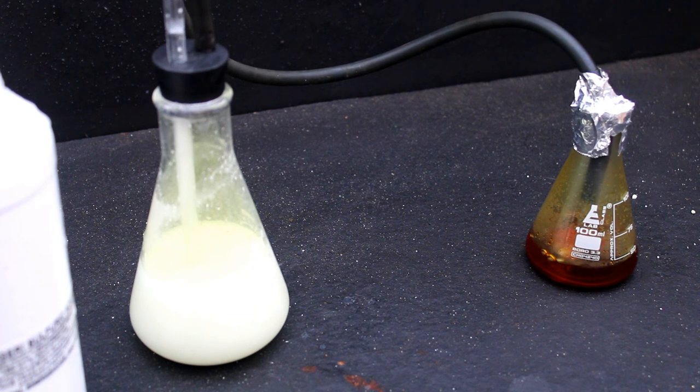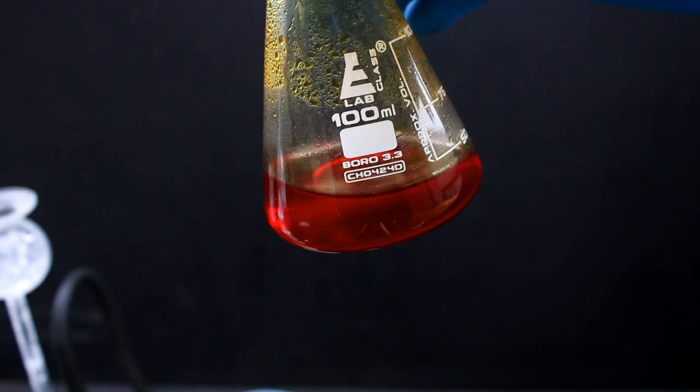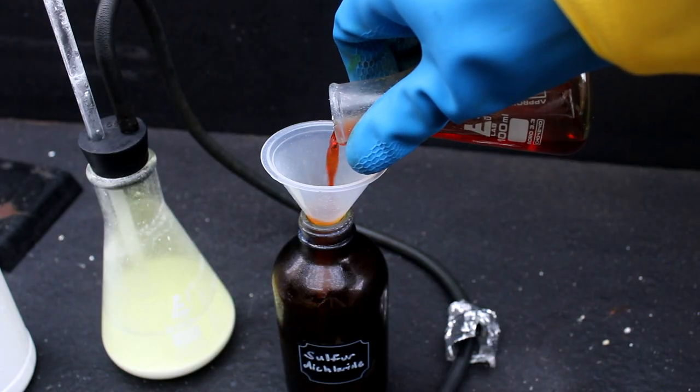An optional third step would be distilling off the more volatile sulfur dichloride, but I chose not to do this because sulfur chlorides tend to leave a lot of unwanted sulfur deposits on glassware, and I didn't have the heart to put my Graham condenser through that. After doing our little workup, I was left with roughly 50ml of bright red sulfur dichloride. This was somewhat of an imprecise procedure, so I didn't really bother calculating a yield.